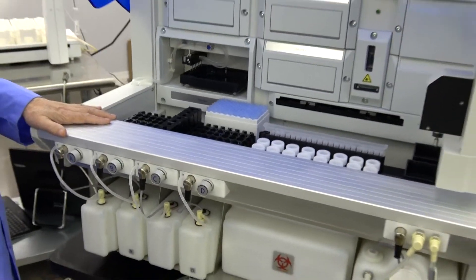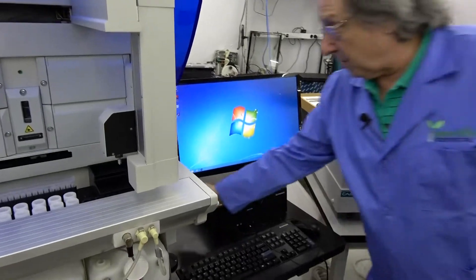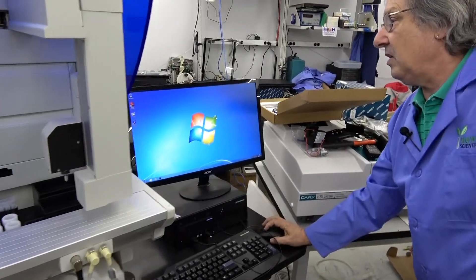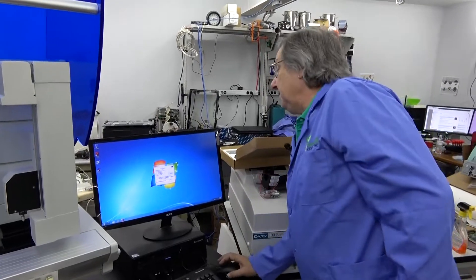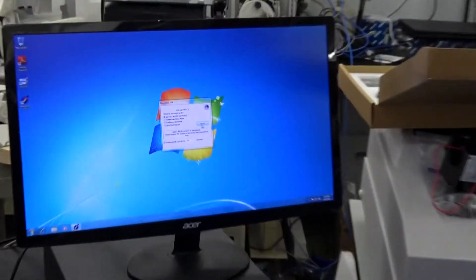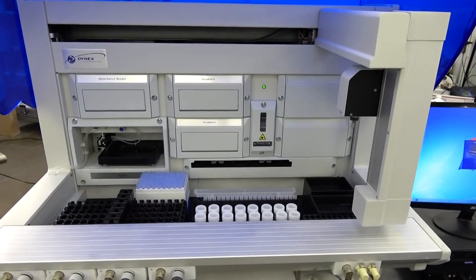Of course there's the computer arm. You're going to have your computer — this one came with a computer. Here we're going to go ahead and start the unit up. These are connected serially, and it's going to ask which port they're plugged in. Check how your system is configured to determine which COM port to use. We'll start the database — you'll hear it initialize the system. The system does its homing and initialization of all the different modules.